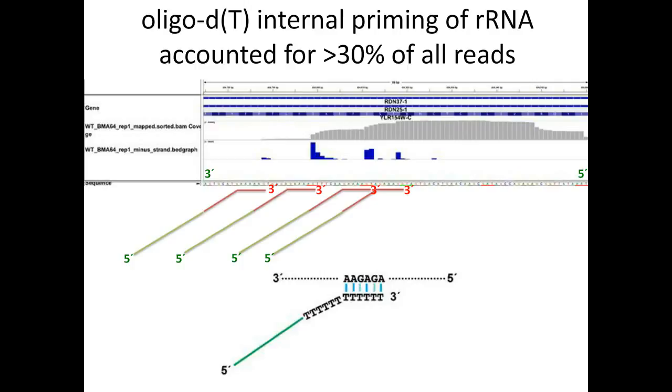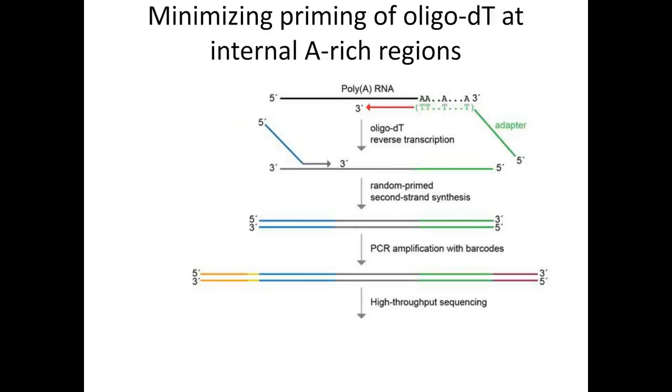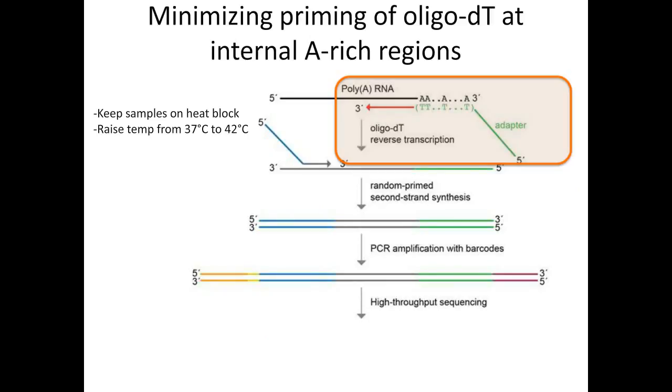So when we look back at the protocol, we noticed that one of the critical steps is the hybridization of the Oligo-dT primer to the poly-A tail. And so a major factor in how the priming will occur is the temperature of the hybridization and the reverse transcription. So what we did for this step was we decided to raise the temperature from 37 degrees to 42 degrees, and perhaps more importantly, we keep the samples on the heating block during this entire step. And in addition, one other modification we made was to increase the cycles from 12 to 15 cycles.